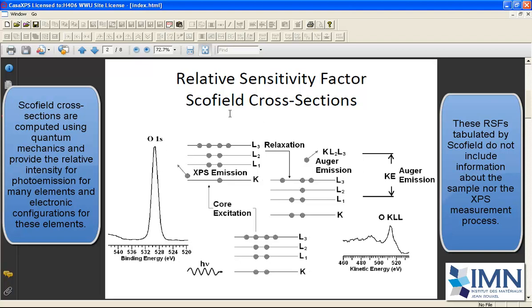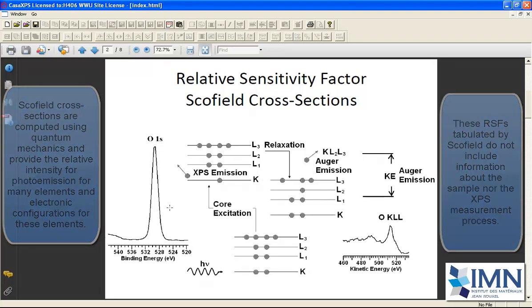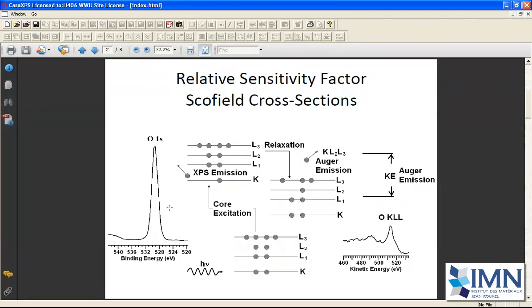So what we do is we compensate the measured intensity using Scofield cross-sections that have been calculated as photoionization cross-sections for a given photon energy, a given element, and a given electronic state.